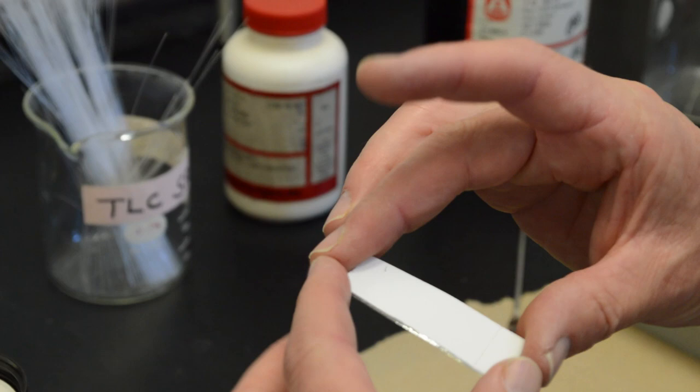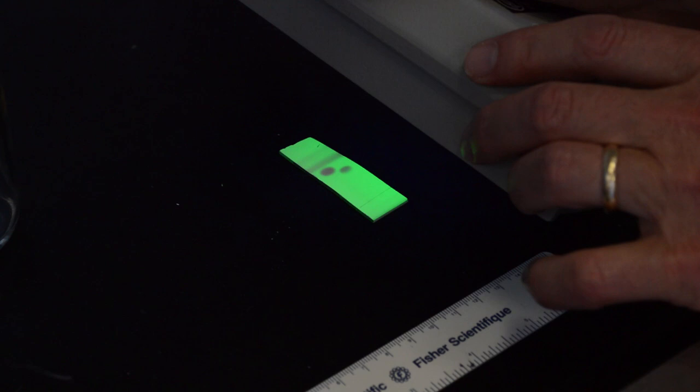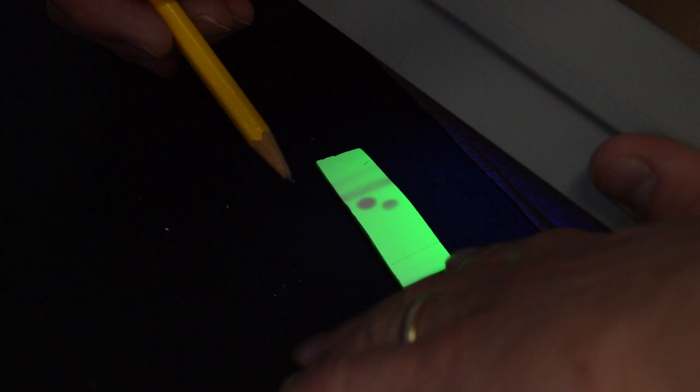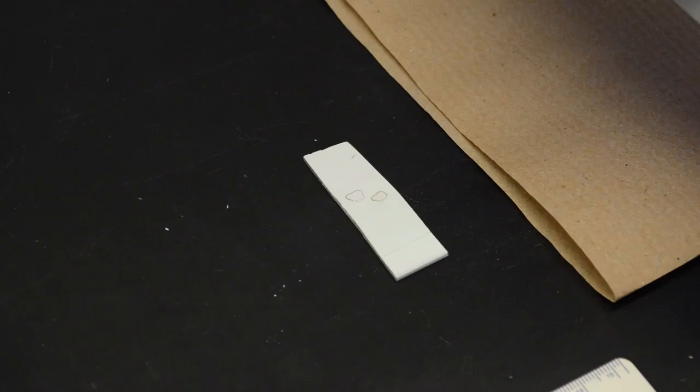And to do that, we will just put our plate down here, and we bring our UV light over. Turn the light off in the fume hood, if it is desirable. And we show it, and there are our two spots. So the left-hand spot, the tetralone was non-polar, it went a little farther up, and the right-hand spot was 2-naphthol, and it is a little lower down. Now, it is convenient to take your pencil and just circle the spots so we have a memory of where the spots have gone. This is a UV light, and you want to avoid shining it on your skin as much as possible.